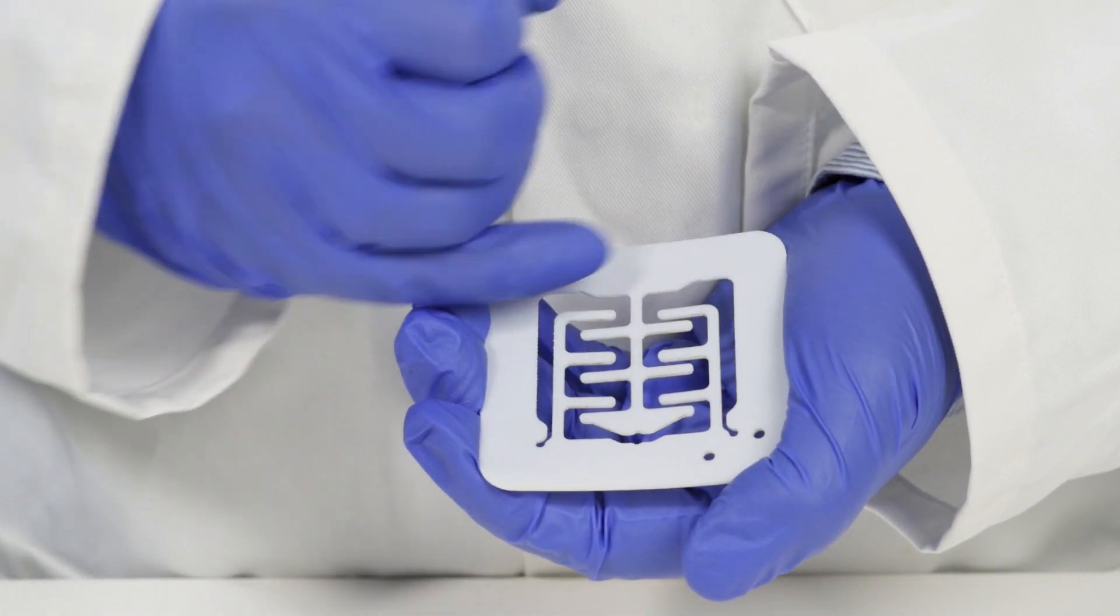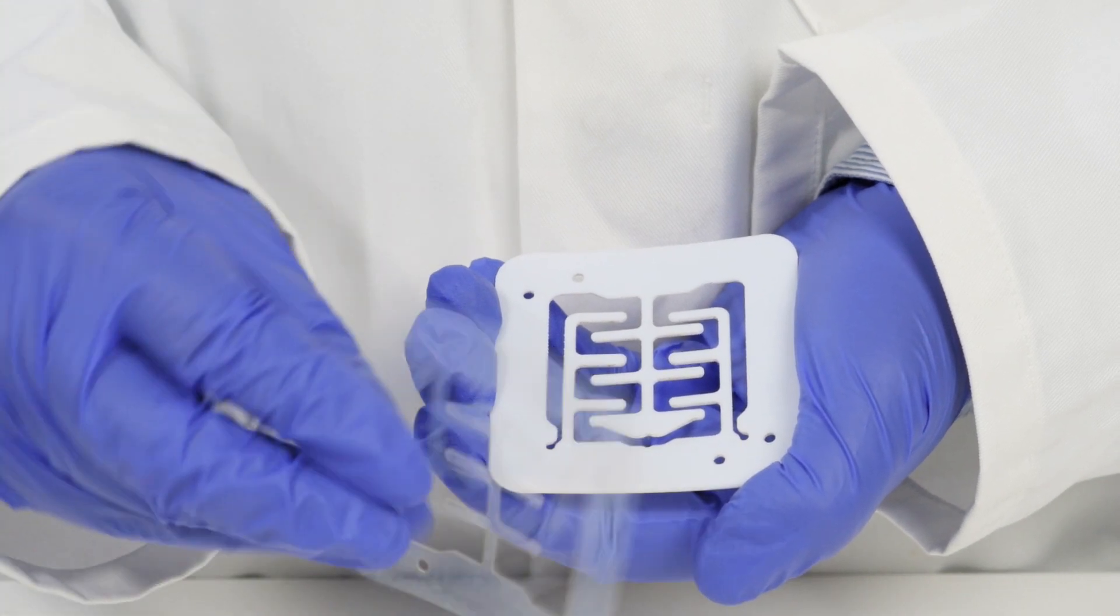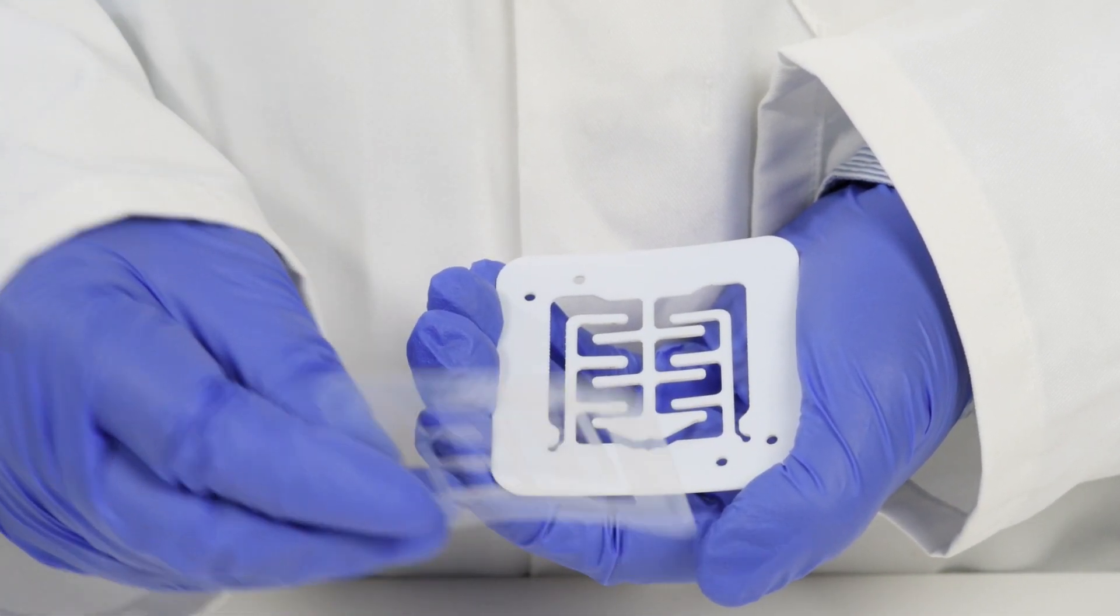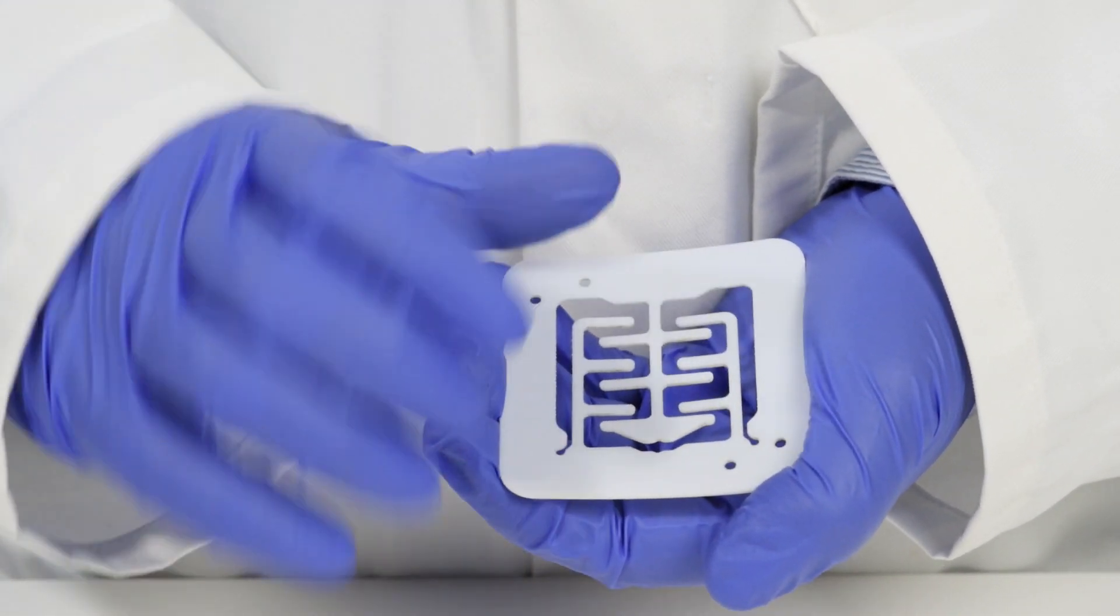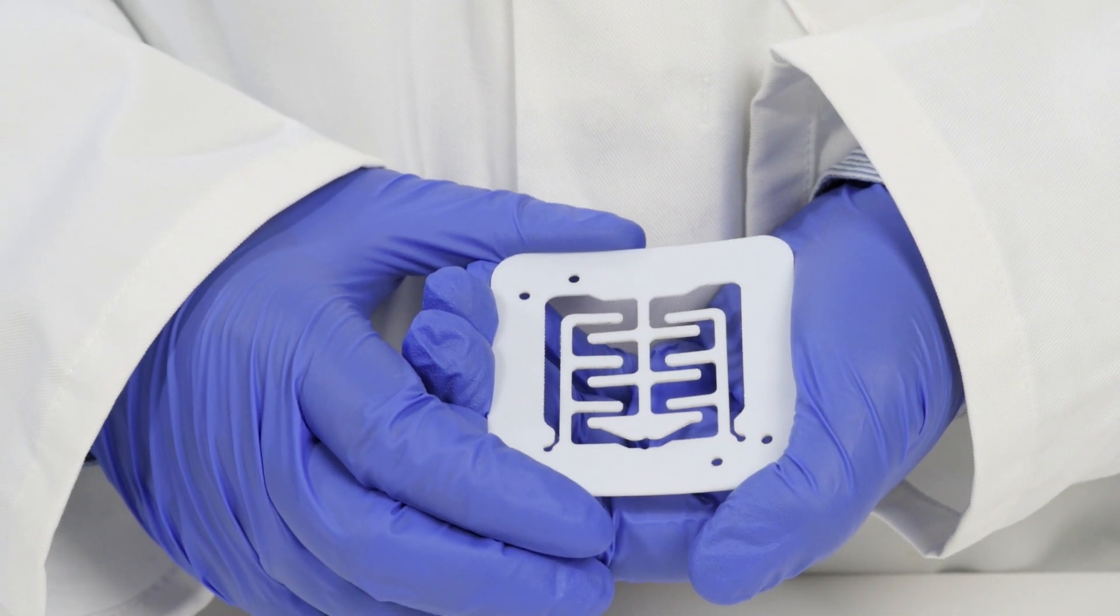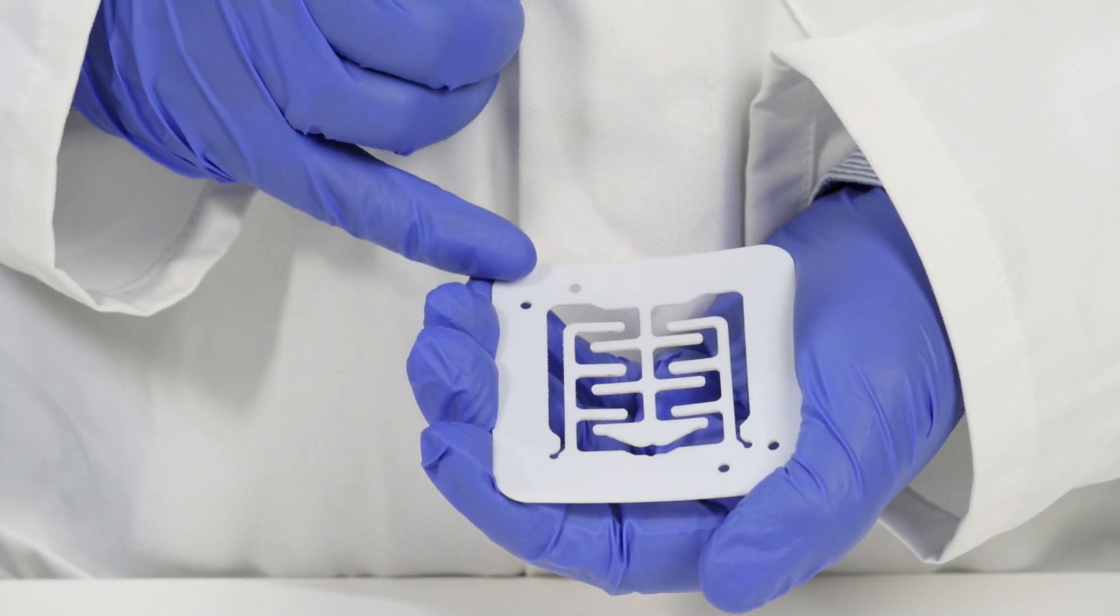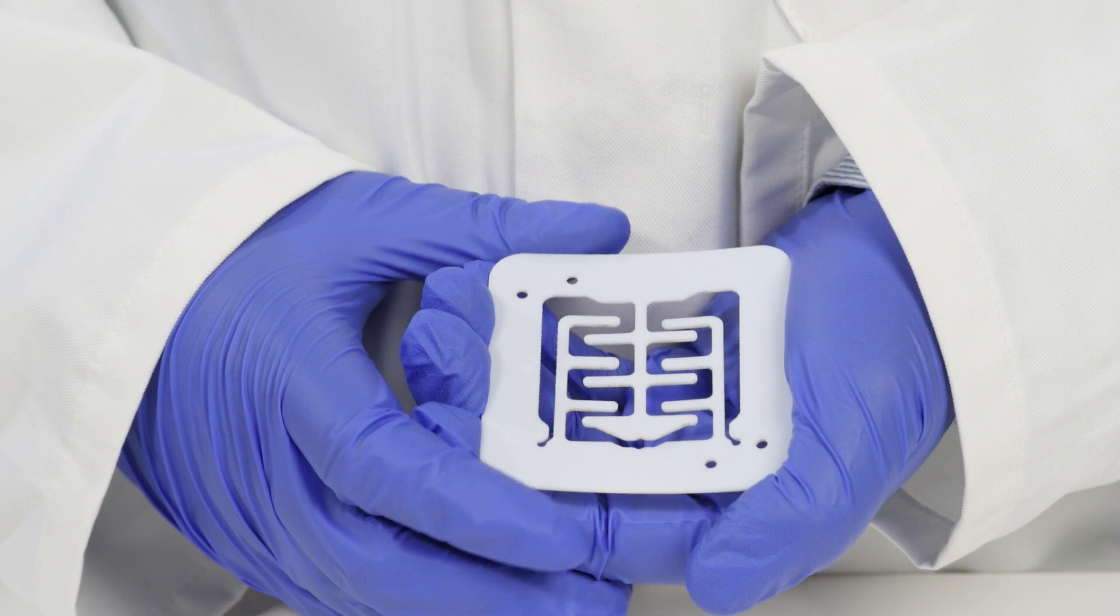We have a range of different flow paths available and a range of different thicknesses of membrane so that you can choose the thickness and the electrode separation that is most suitable for your chemistry. The membrane fits onto the locating pins on the electrode plate.